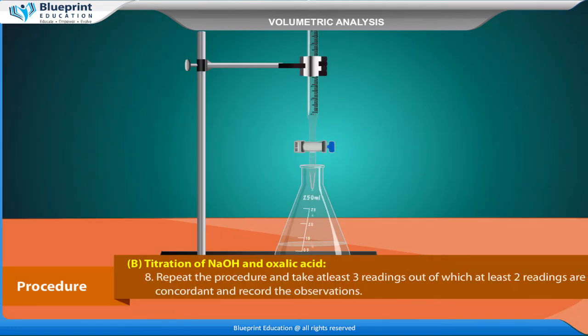Repeat the procedure and take at least 3 readings out of which at least 2 readings are concordant and record the observations.